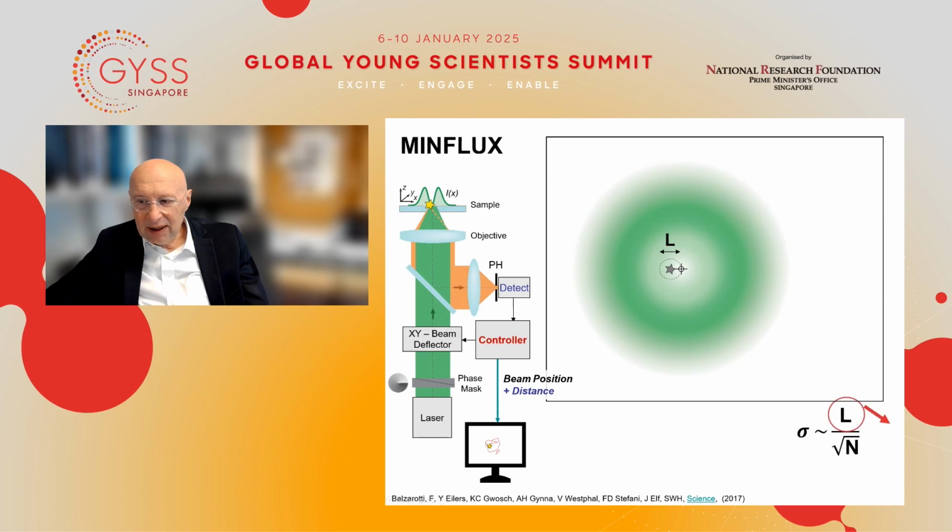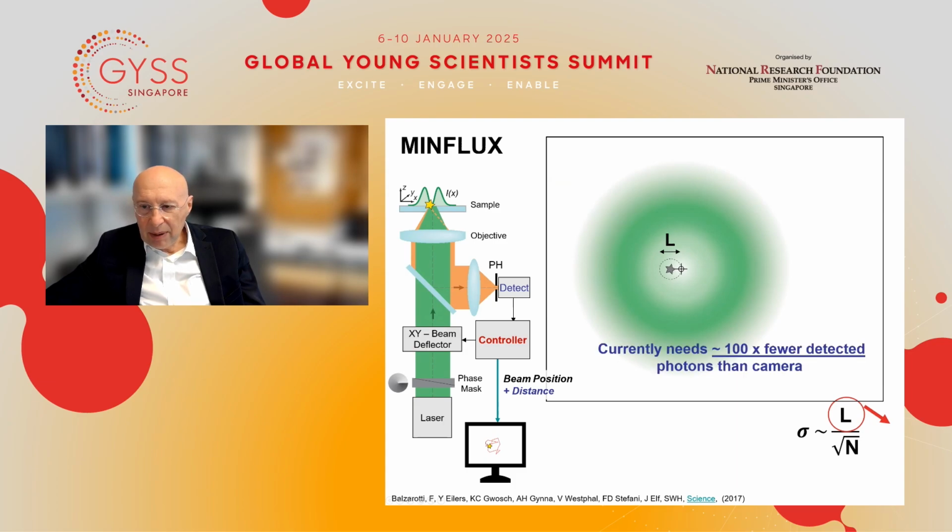then the precision sigma goes up, because the number L, of course, goes down, then sigma goes down, meaning that precision is higher, because higher precision means smaller numbers of sigma. And this is very good because now we have a handle on increasing the precision. Previously, we couldn't do it because the wavelength was fixed. This relies on the maximization of photons. But now, if we manage to get these two as close as possible, precision goes up.